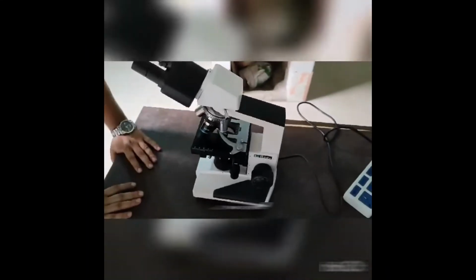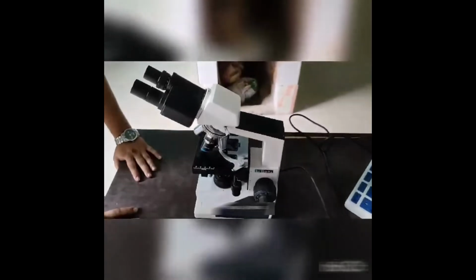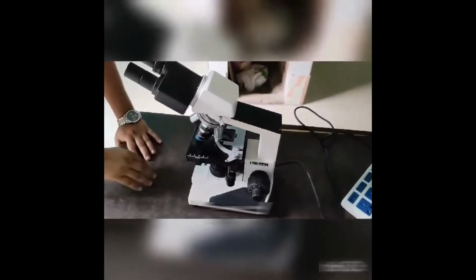Students, this is your first practical class. This is a compound microscope. Today we will talk about its parts.